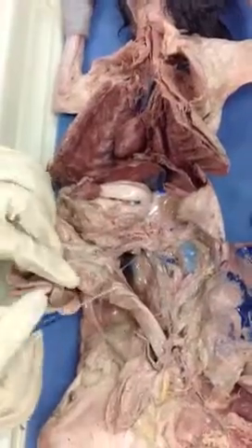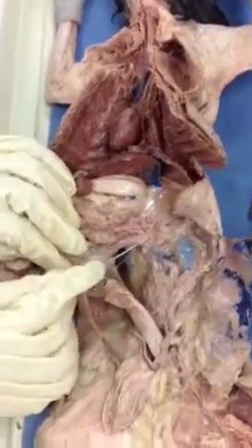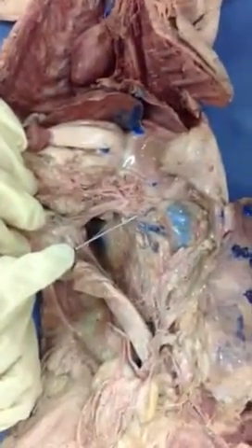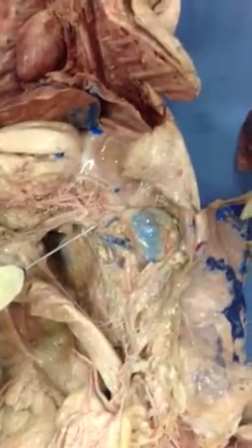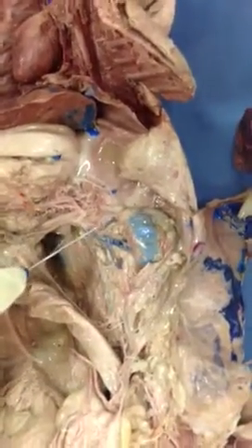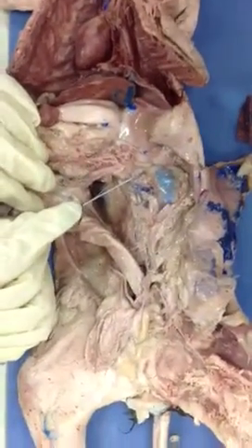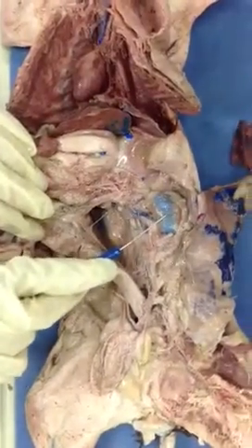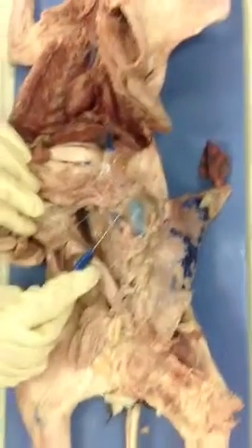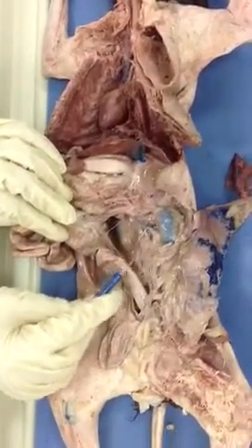Yes? Very good. The next branch is going to be this very small vessel. Very good. What's it called there? Is it the renal artery? Adrenolumbar. You see how small it is? Adrenolumbar artery, adrenolumbar vein, right? Now, I see my other structure here. What's this structure? Kidney. I see a blood vessel here, right? Renal. Very good. So that's my renal artery and my renal vein.